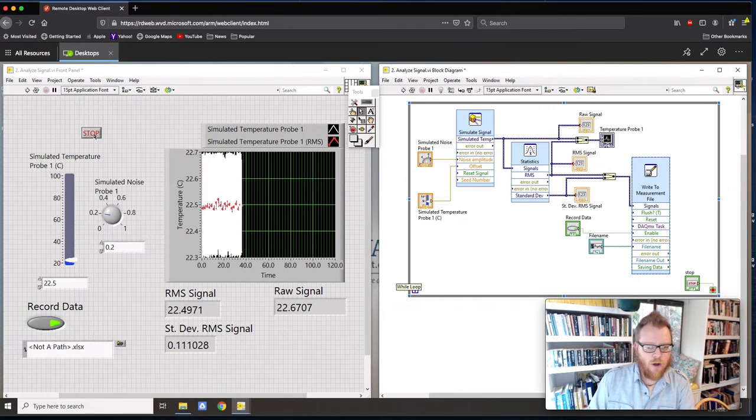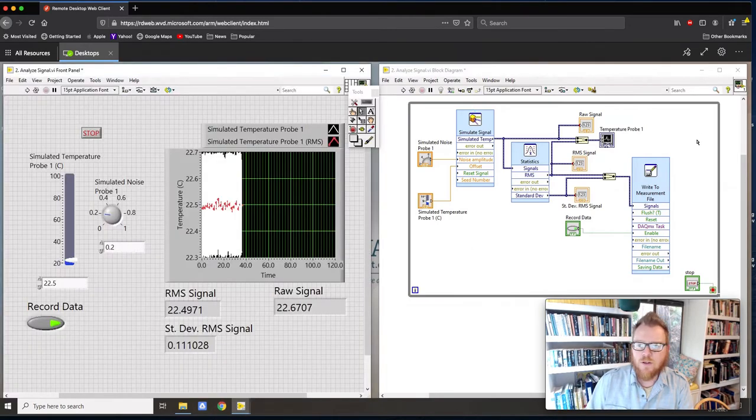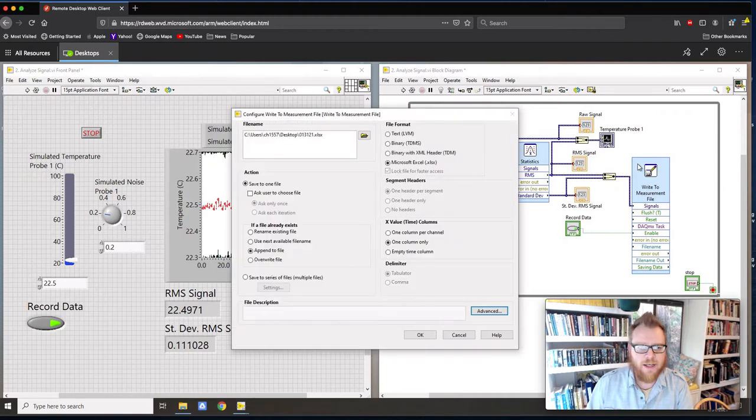Okay, so I think I know what went wrong. Aha, so I think I know what happened. With this initial setup, I've noticed what it wants you to do initially. So did it make my file? Okay, it didn't make my file yet. So when I double click in here, yes, so I probably should have had that set up to begin with.